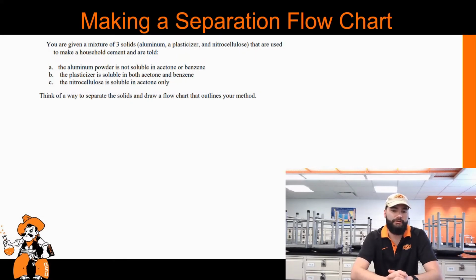The first thing we need to do whenever it comes to separating a mixture of multiple solids is design a flow chart separating the solids out based on their solubility. In your lab manuals on page 2-3, you have these facts given to you.